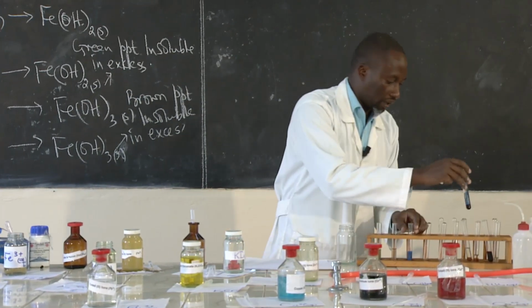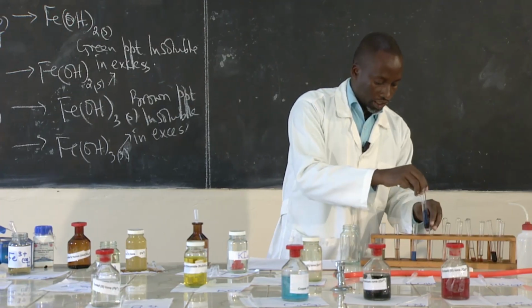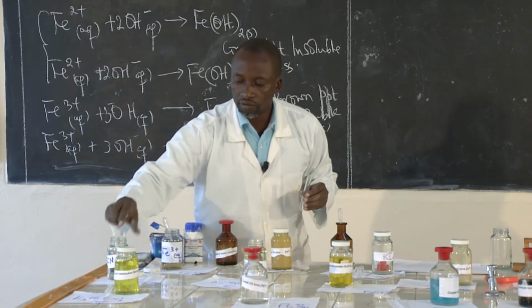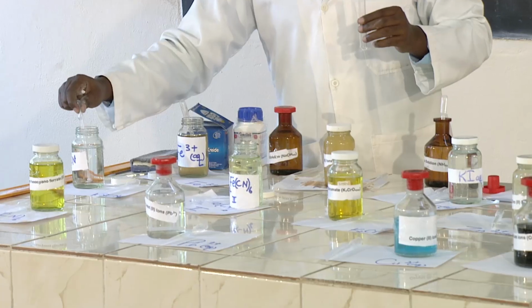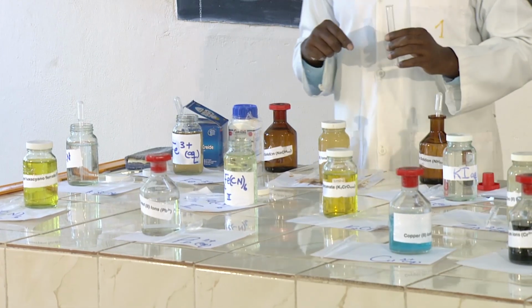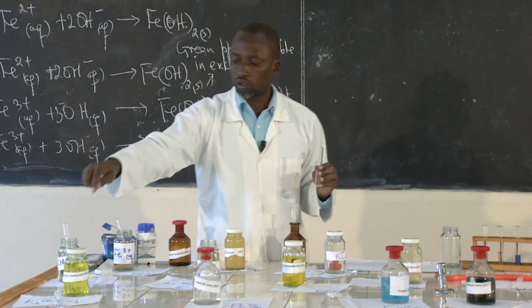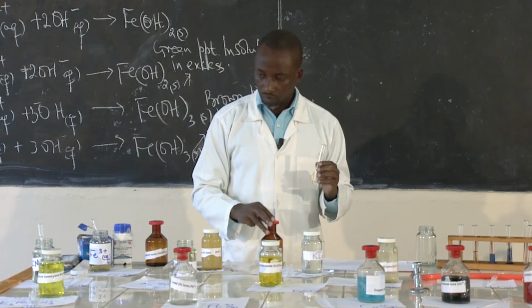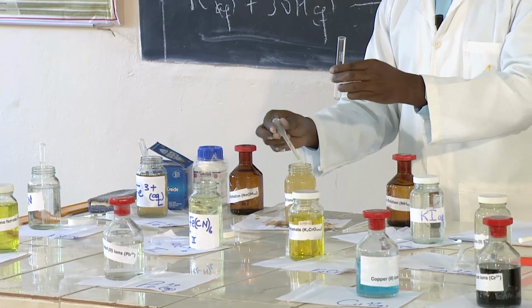So let's look at the potassium hexacyanoferrate 3 with these two compounds. We have this iron 2. So we are going to look at it with this one. Iron 2 first, some few drops.